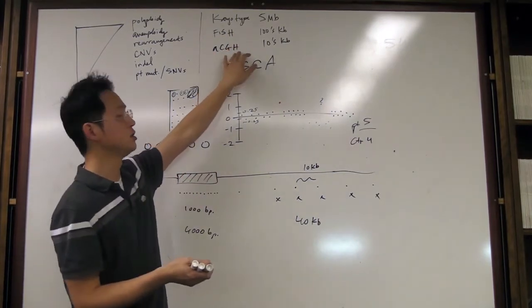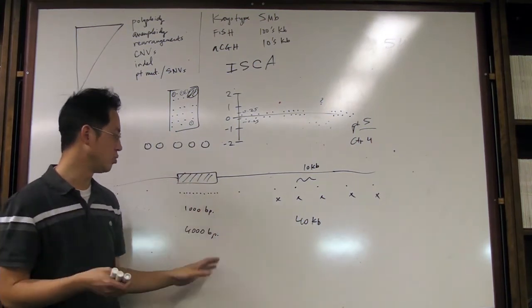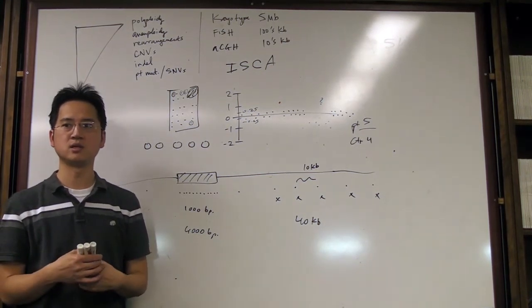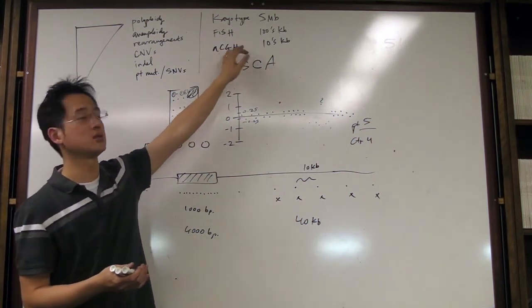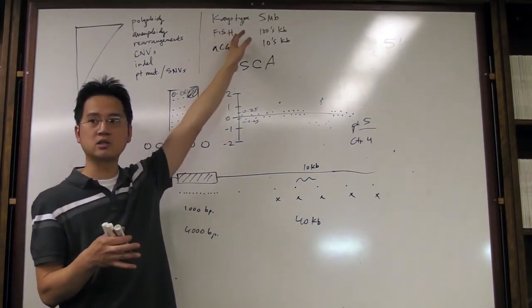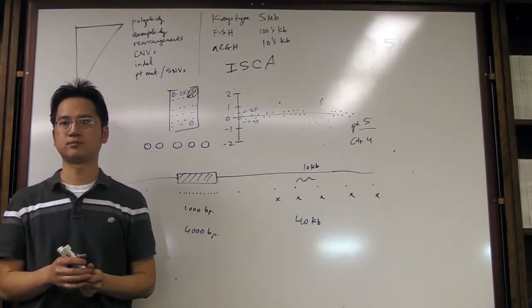And then you go back and do the array. Now you're doing sort of non-biased throughout the genome, and you will be able to pick up something that's 500,000 bases, or even easily 2 megabases will be easy to detect on this assay. So that's the power of array CGH. It gets you the specificity that you get with FISH, but also the genome-wide coverage that you get on karyotype, but also at a much better resolution than you get with karyotype.